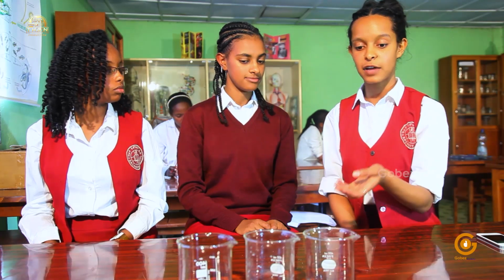But for that experiment, we require clean beakers. So we should wash the beakers we just used. We now have our clean beakers.